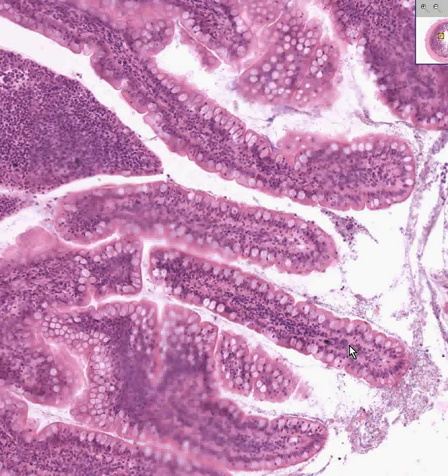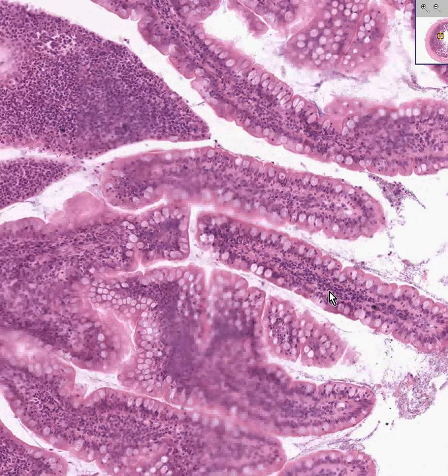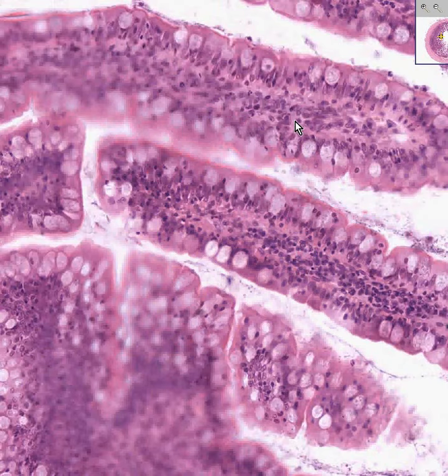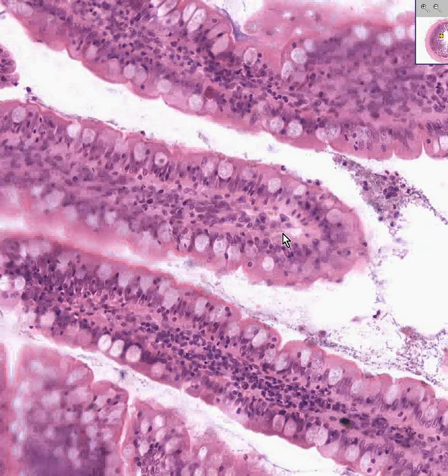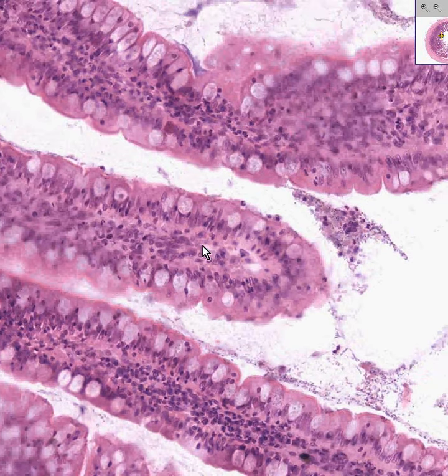The lamina propria constitutes the core of these papillary villi in the mucosa, and like any other lamina propria it is rich in cells like lymphocytes, macrophages, fibroblasts, and blood vessels. In addition, you will see many of these lymphatic-looking spaces, in other words, thin endothelial-lined spaces with no blood cells, which are the lacteals.